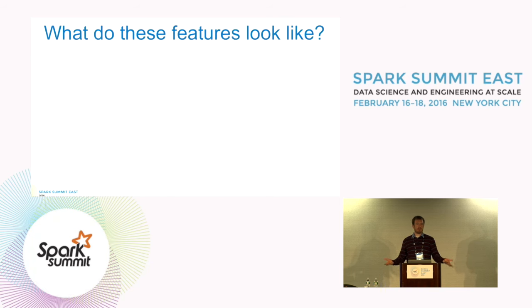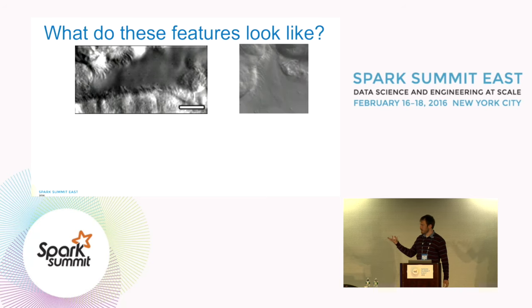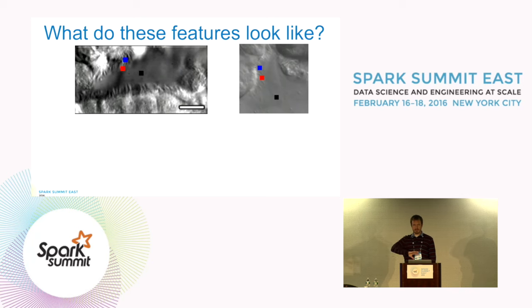So what do these features look like? Okay, I've described rotation and deformation, but what do they look like in practice? I'll give you these two videos again, one normal one on the left, a highly abnormal one on the right. And we highlight 3 pixels in each of these videos. Blue is a pixel that's very close to the cell wall. Red is a pixel at the tips of the cilia, and black is a pixel just out in the fluid.